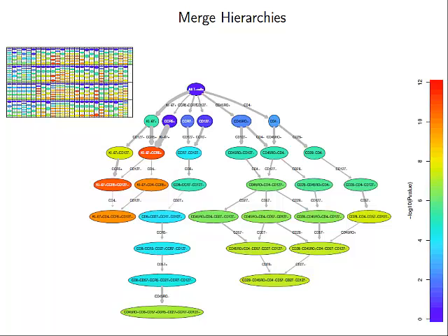And out of all these, here it is. This is your data. It's all 466 samples. You don't have to look at dots anymore. You don't want to look at gating. This is sort of a meta-analysis, meta-overview. And so the interesting thing is, here's some stuff that pops out. It's kind of easy for Mario to understand. I want to look for stuff that's up here. There it is. You don't have to look at any gates at this point. The computer just said, here's the most important immunophenotype.